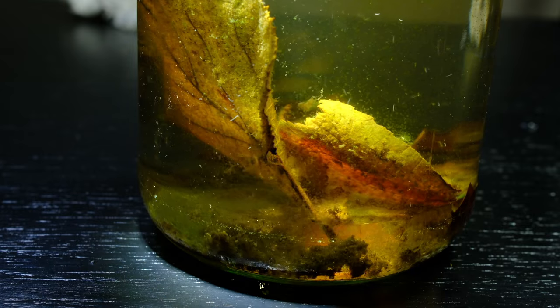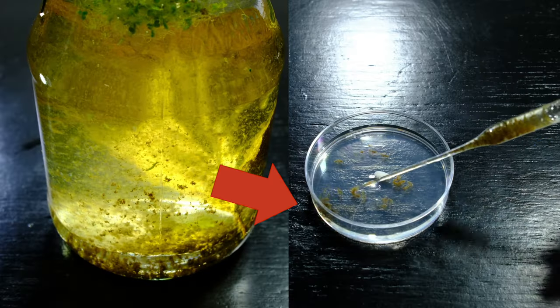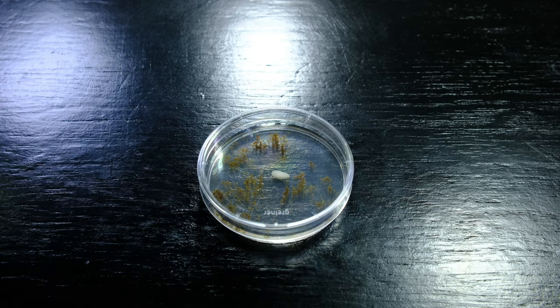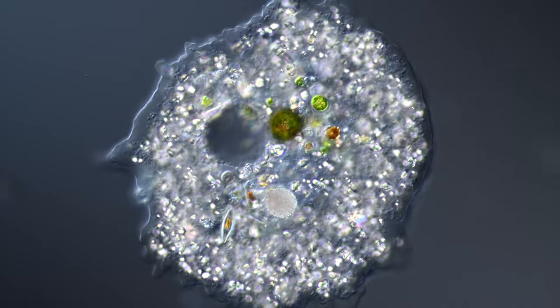Use a pipette to siphon off the flaky material that gathered at the bottom of the container we kept the week-old pond sample in. And add a few drops of the material containing the amoebas to the culture vessel. Place the Petri dish in a dark place with a constant temperature of 20 degrees Celsius.